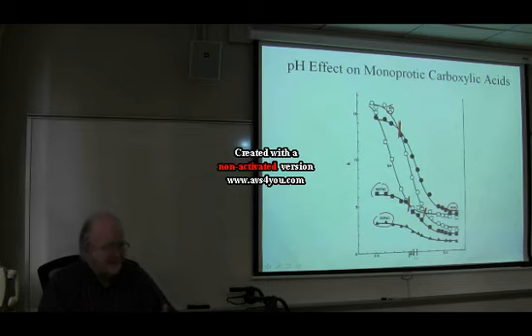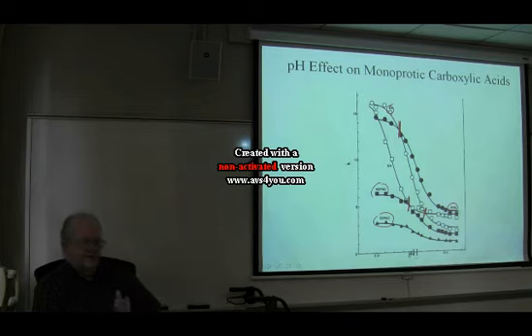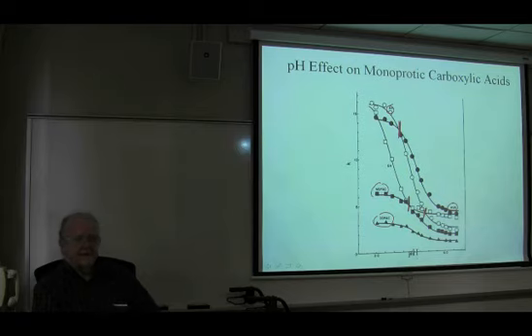That's not a big pH range. What you're going to have to do to make this work is find a pH where their retention factors are different. So we really need to understand how the retention factor varies with pH.